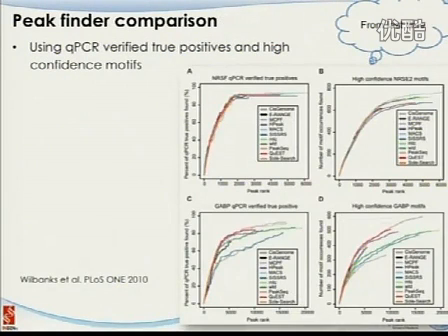Okay? And we mentioned there are maybe a dozen, maybe 2 dozen peak finding algorithms that have been reported over the past couple of years, especially in 2008 and 2009, because ChIP-seq came out early, and this is the first real application that occurred in 2007. So there are so many different approaches, but which one to really pick?